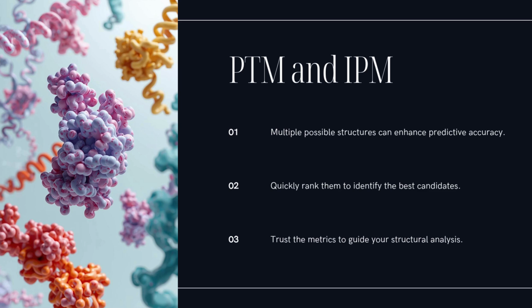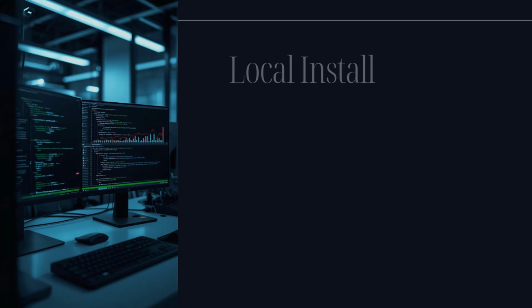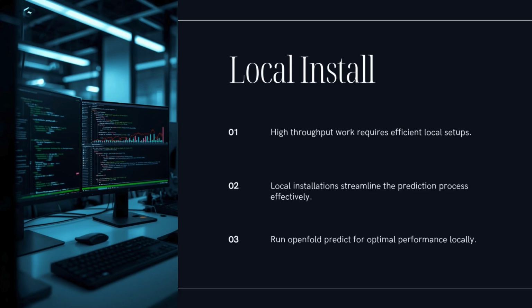Okay, PAE, what does that tell me? PAE estimates the expected error in the distance between any pair of residues. So if you look at the PAE values between residues on chain A and residues on chain B, low PAE values there suggest the model is confident about the relative positions and orientation of those 2 chains. So low PAE across the interface is a good sign for a complex. Exactly. It's your best proxy for whether the predicted interface between molecules, protein, DNA, whatever, is likely stable and correctly modeled. Got it. pLDDT for local confidence, PAE for interchain or domain confidence.